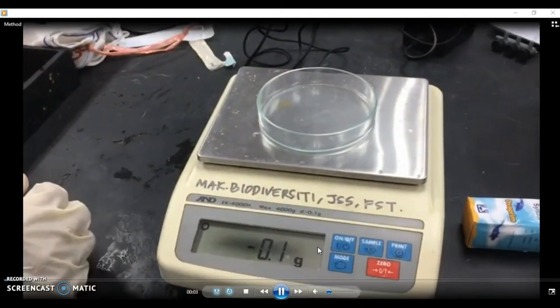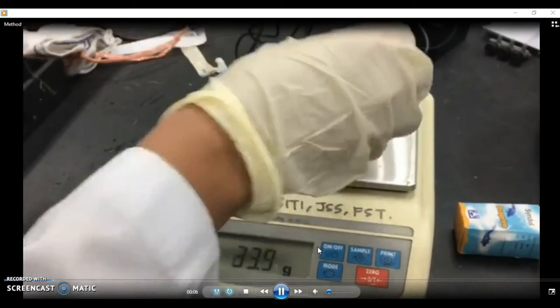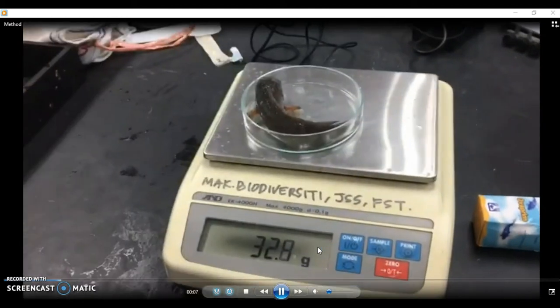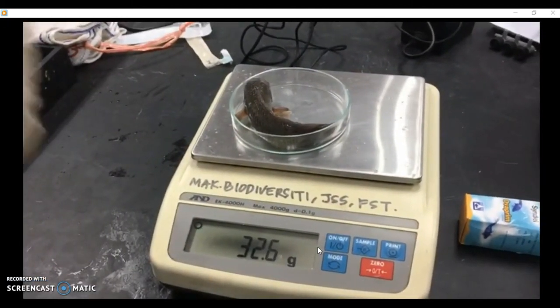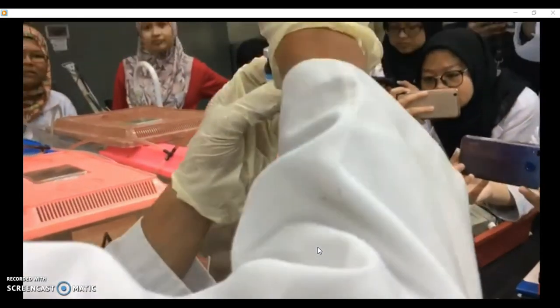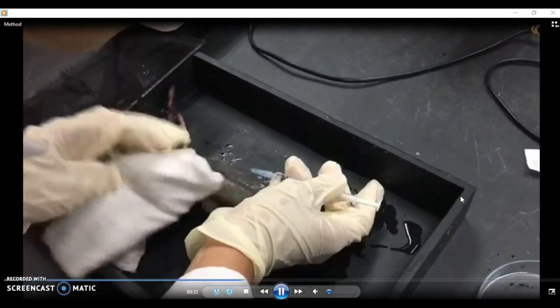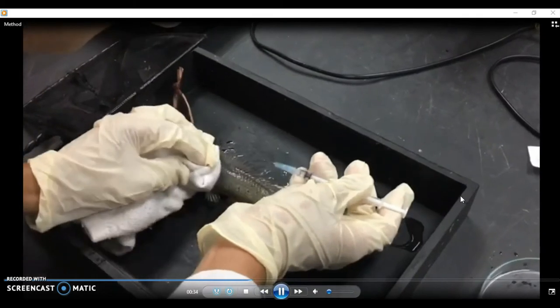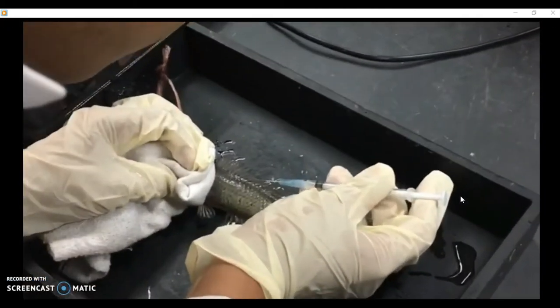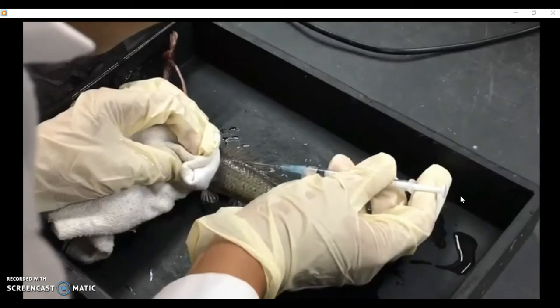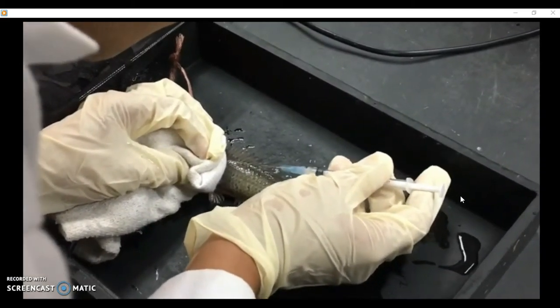For the methodology, first we take the fish sample from the aquarium. Then we weigh the fish to determine the volume of hormone that we should inject. After that, we inject the fish with Ovaprim. Ovaprim is a hormone to induce spawning which triggers the fish to release eggs and sperm.